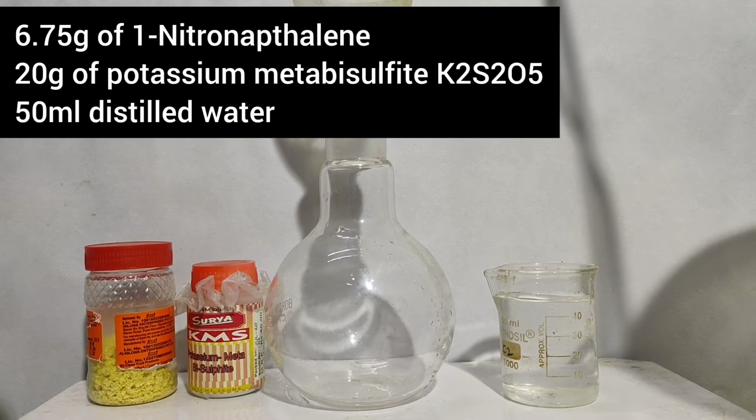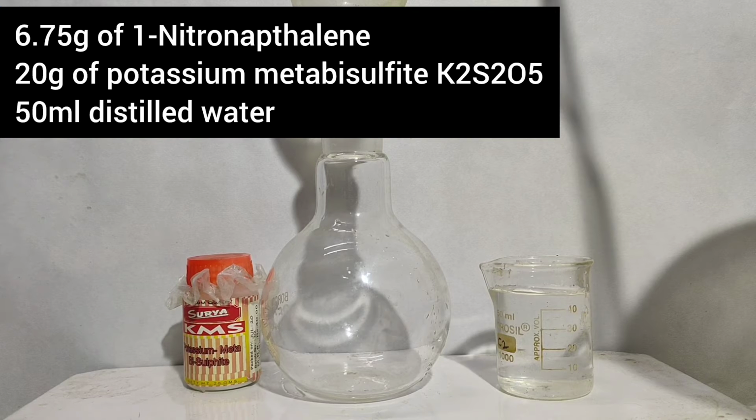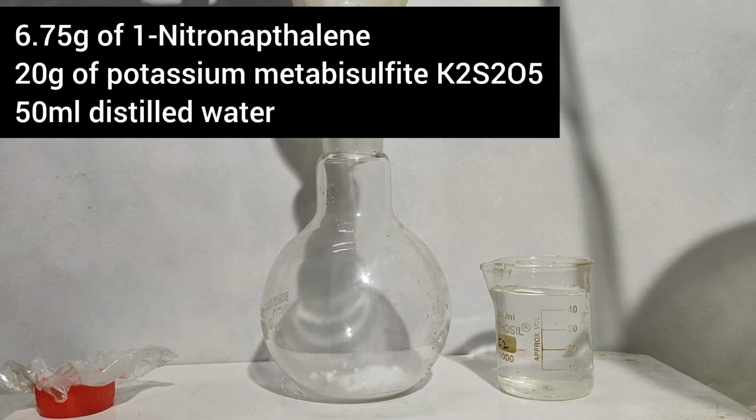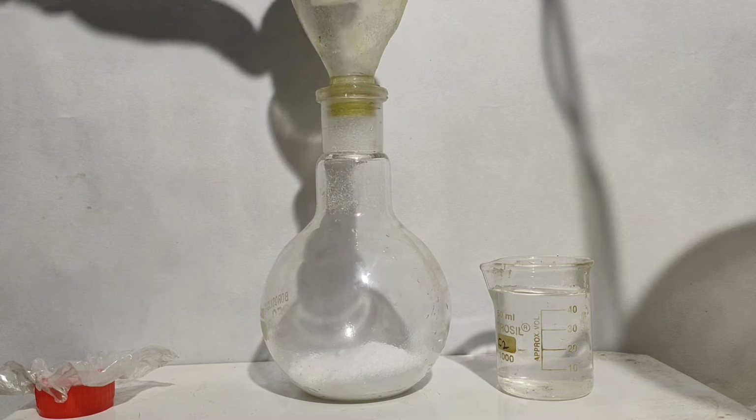To start things off, I took 6.75 grams of alpha nitronaphthalene that I prepared in the last run, and 20 grams of potassium metabisulfite.